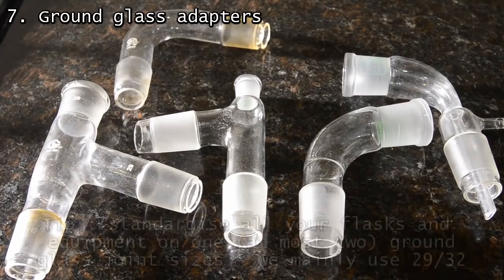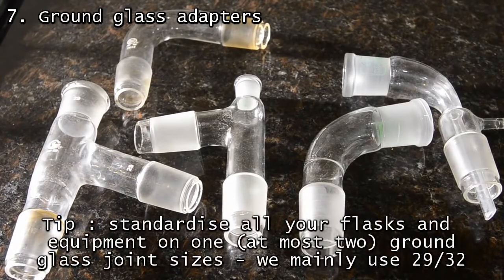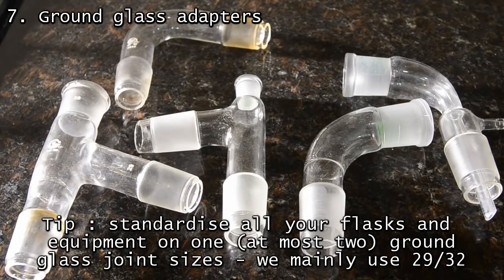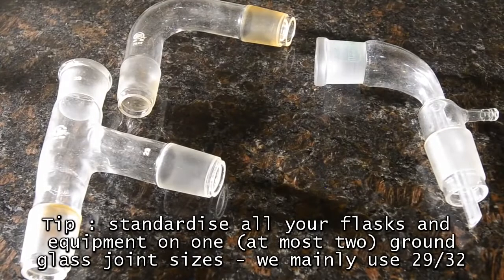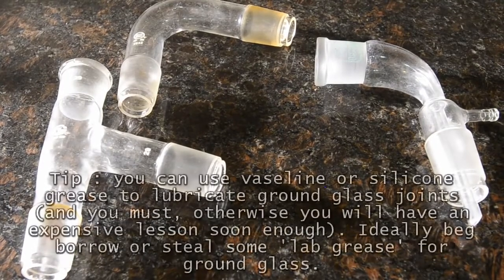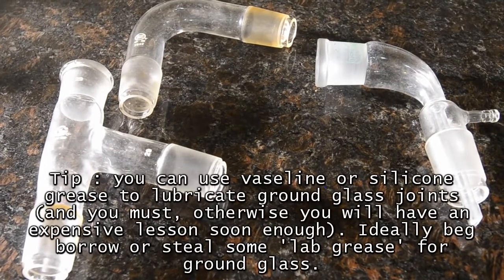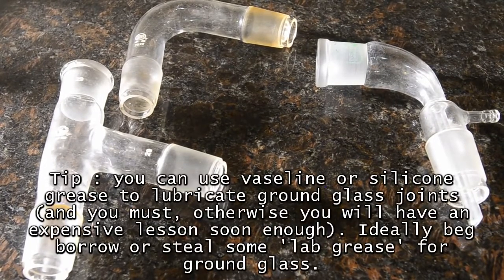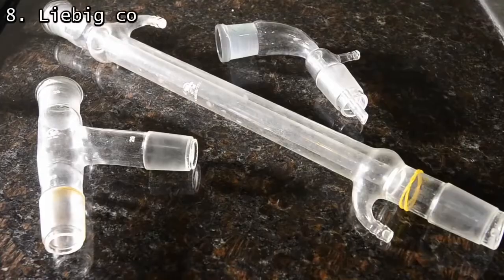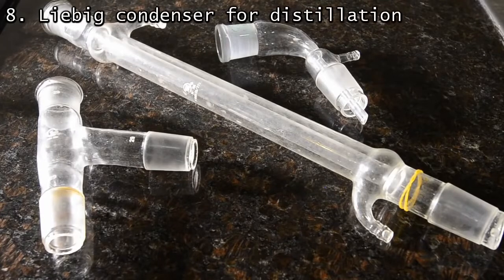The most important thing is to standardize on one joint size so that you can interchange and fit anything together. We chose 29/32, mainly because this is what is available — it's a European size. If you are in the US, 24/40 is easier to get hold of. The three adapters here are what we use most of the time for distillation. For distilling, you'll need a Liebig condenser.